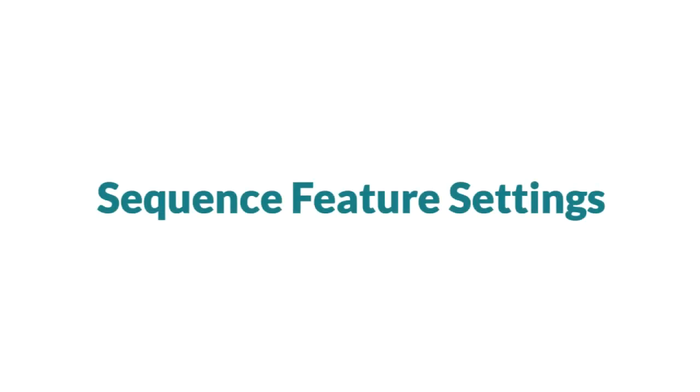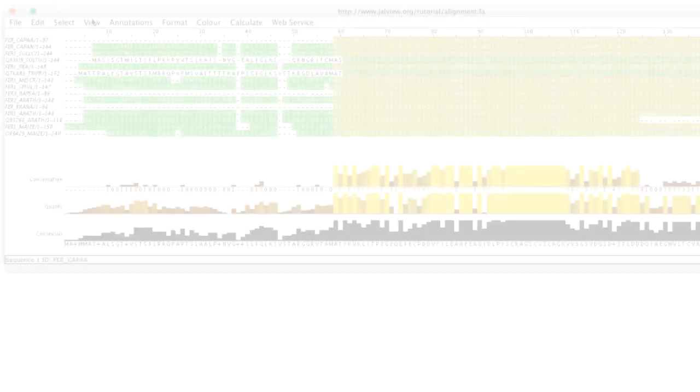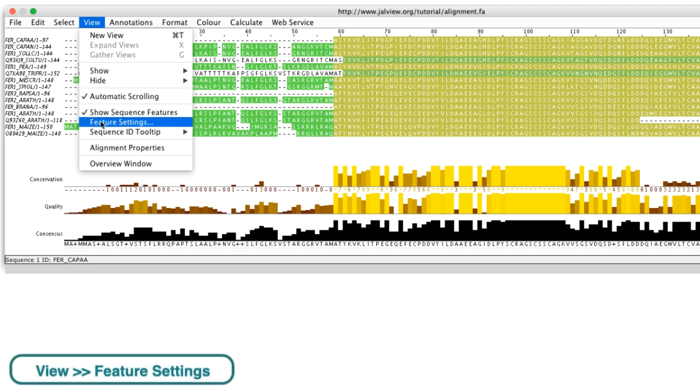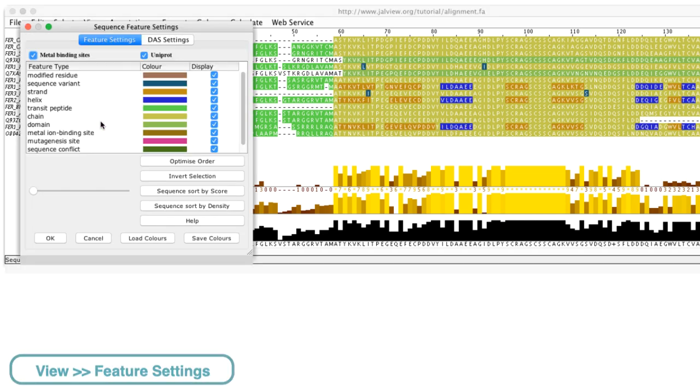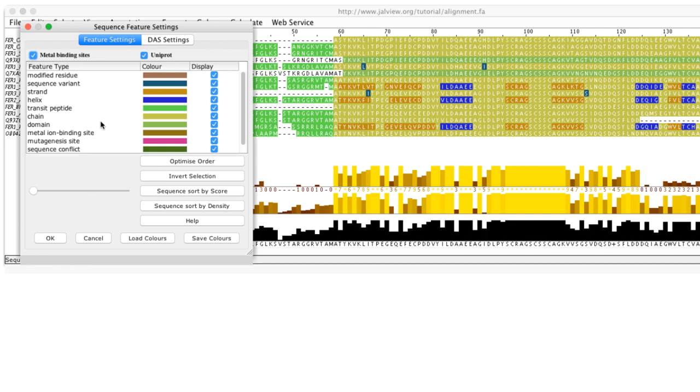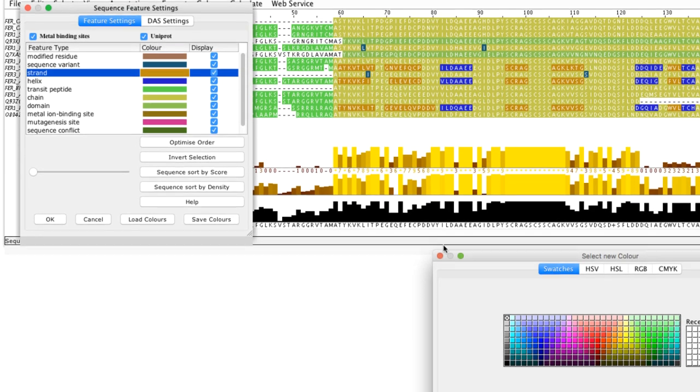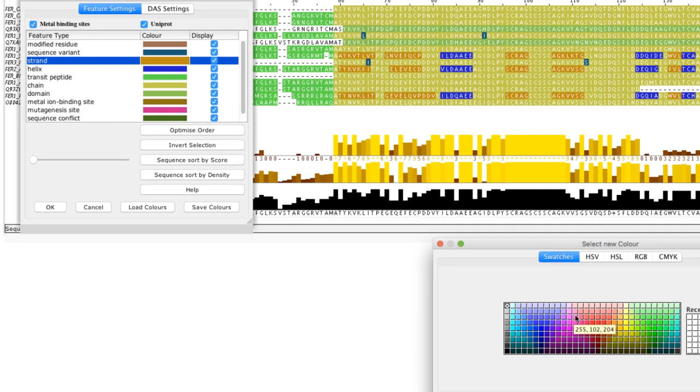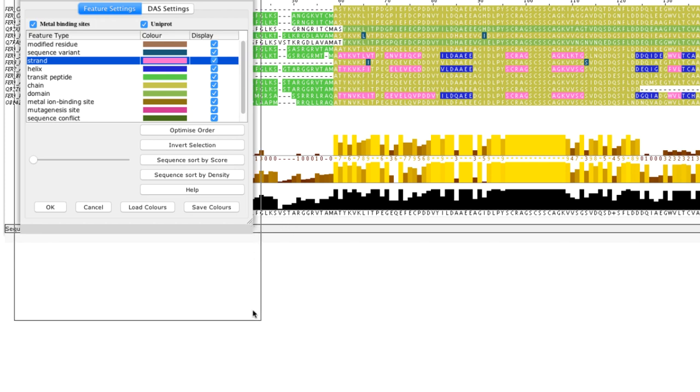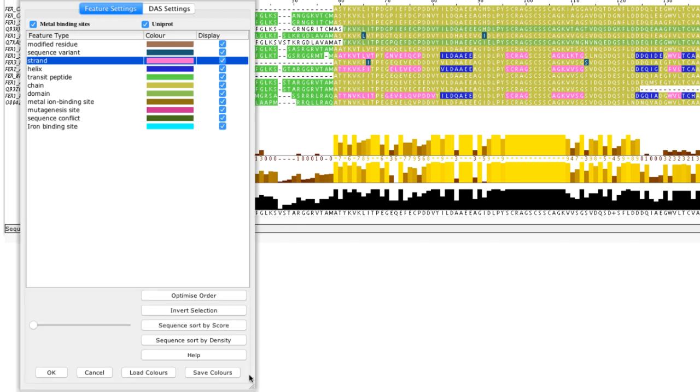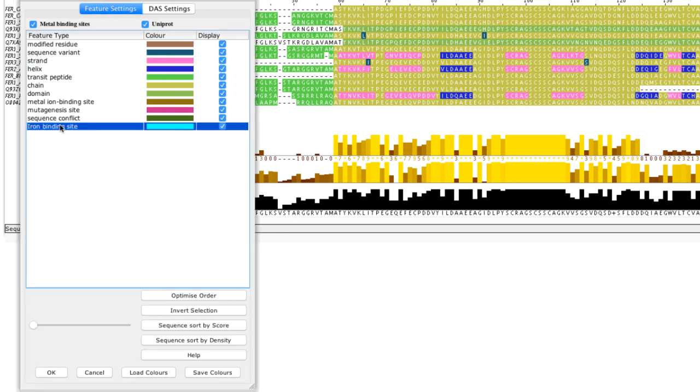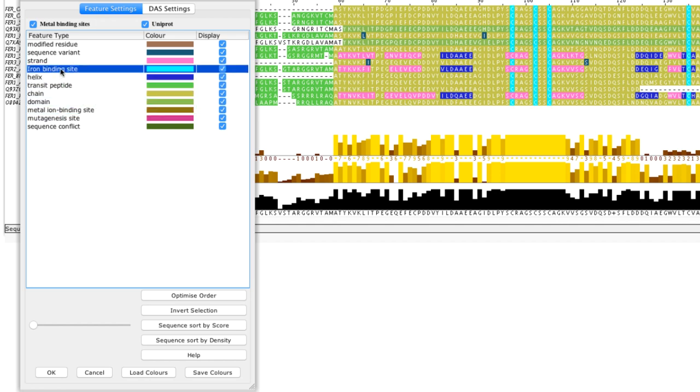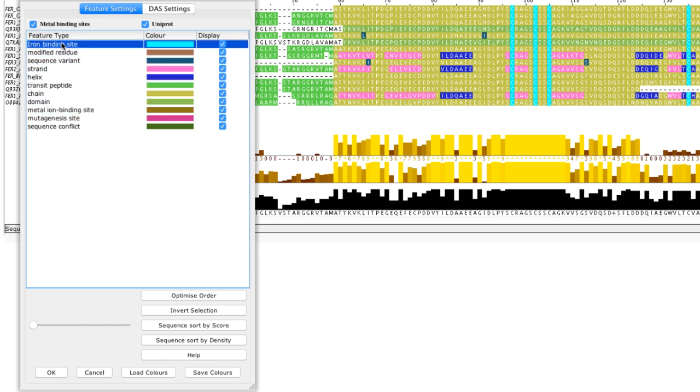If I open the sequence feature settings dialog box by going to the view menu and selecting feature settings, I can see all the features that have been imported. I can change the color of features by selecting the color box and selecting the color as appropriate. I can change the order of the features. For example I can drag the metal iron binding site feature to the top. Note that on the alignment the features at the top of the list will overlay the features below them.